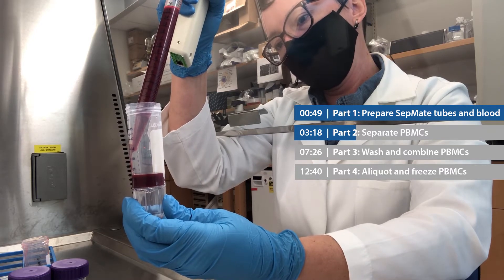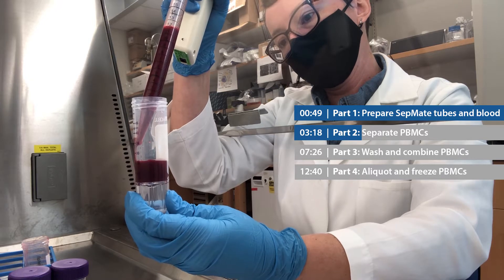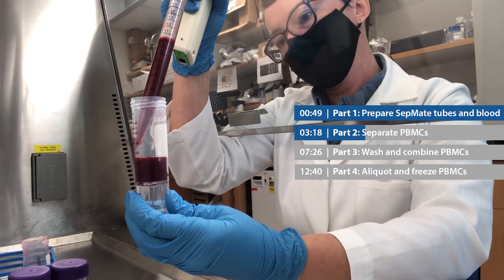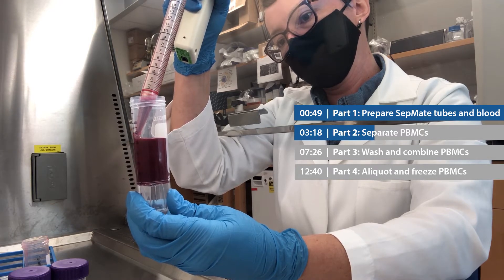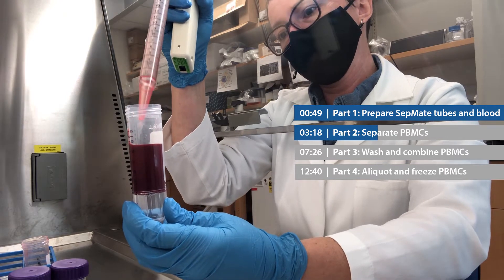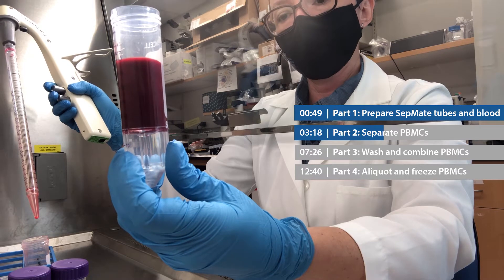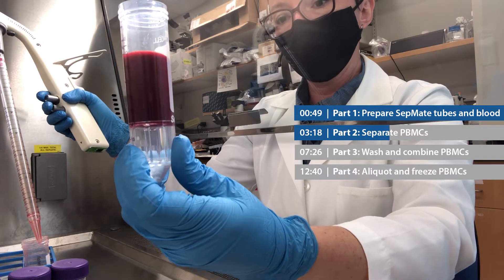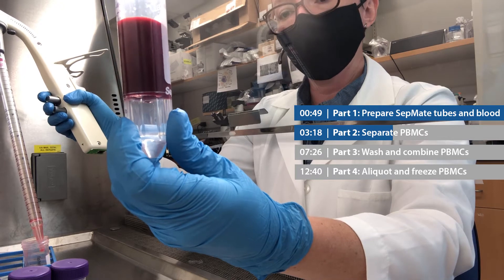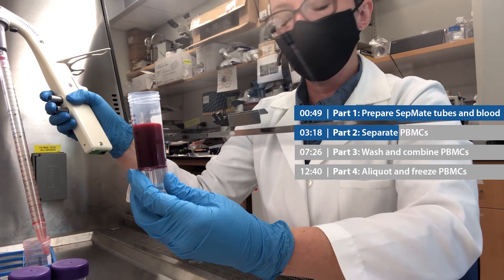It's really tempting to tip the SepMate tube a little bit, but it's actually important that you keep it upright. This is what it should look like. You might notice that the blood has mixed with a little bit of the lymphoprep media above the plastic insert — that's okay. You might also be able to see there's a tiny bit of blood below the plastic insert — that's okay as well. Now I'm going to repeat this with the other three tubes until I've used up all my blood.